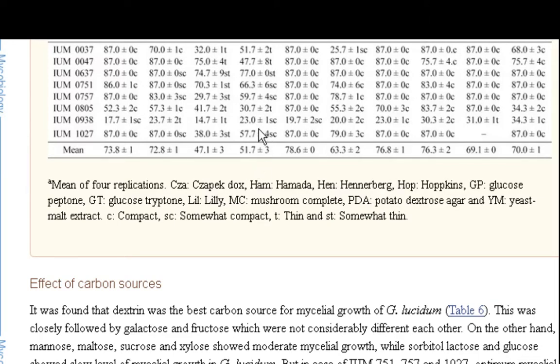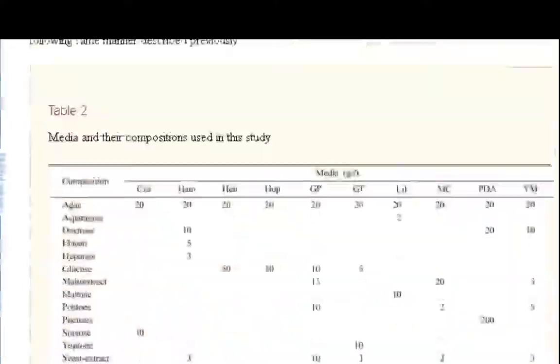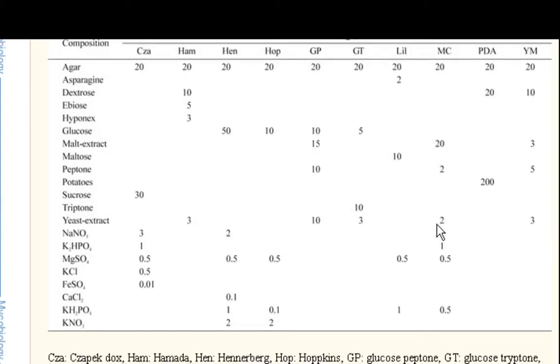Those are really high. Potato dextrose. I don't see why I couldn't just use table sugar. I really don't see why I can't. I may just do it anyway. Just say the heck with it. So if you go back up to this list, they're using 200 grams of potatoes and 20, but we're going to go look at that video. That's like 10%.